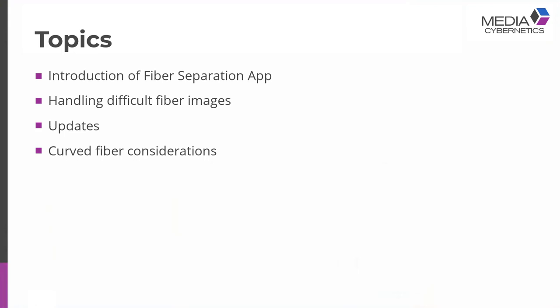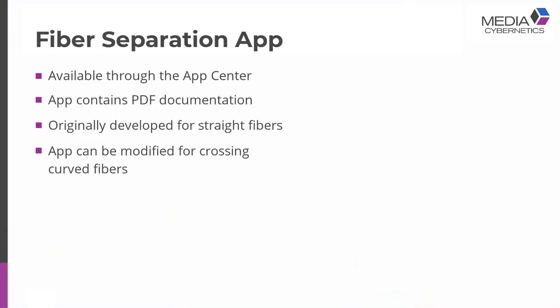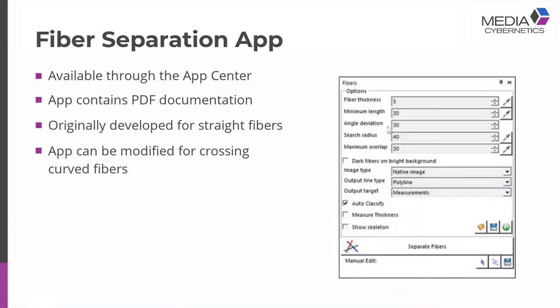The fiber separation app is available through the Apps ribbon in ImagePro and through the App Center. You can download it directly into ImagePro and it will install. If you've never tried that before, it's very simple and straightforward. There's PDF documentation available — if you hover over the app, there's a PDF explaining what the features are and a walkthrough of the fiber separation app. This is true for any app posted.